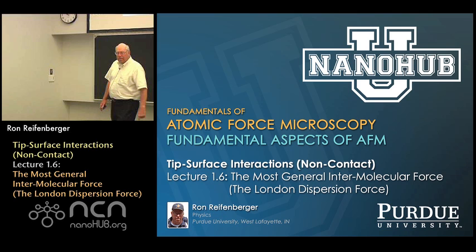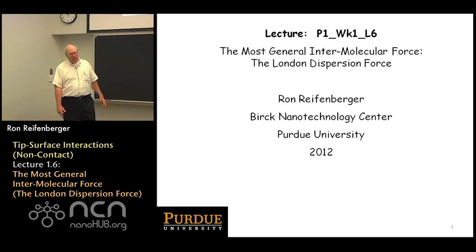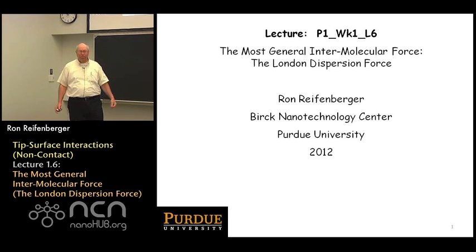nanoHUB-U, online instruction. Hi, we're back for lecture 6 of week 1. In this particular lecture, we're going to discuss the most general intermolecular force. It's referred to as the London dispersion force. I should say up front that even though I say molecule interacting with molecule, it could be atom interacting with atom. It just depends on the particular system of interest. So you have to always keep that in mind as you listen to these lectures.